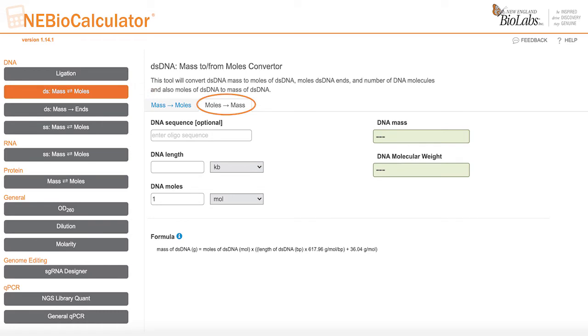Based on the parameters of our example, we know that the size of the fragment is 6 KB. Enter that into the DNA length section of the tool. Under DNA moles, you know that 27 femtomoles is recommended. Enter that into DNA moles. Please make sure that you are selecting the right units from the pull-down menu.